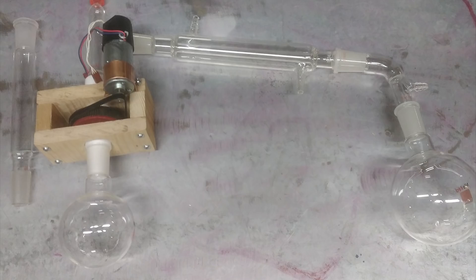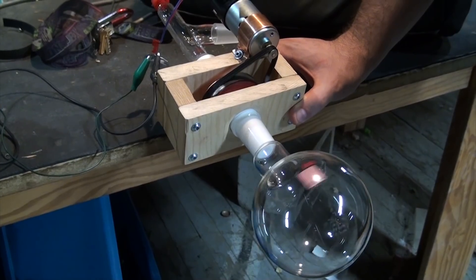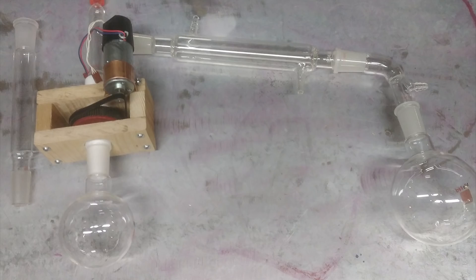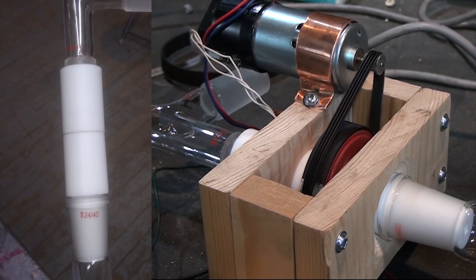Today we won't be building the whole rotovap as I still need to finish installing the vacuum system into the lab and get my cooling pump set up. Instead we'll just focus on making this coupling — it's the hardest part of the system by far and the rest is mostly just off-the-shelf parts that fit together. When we get to the biomaterial videos I'll set up the whole system and put it to good use. Anyway, let's jump right in.